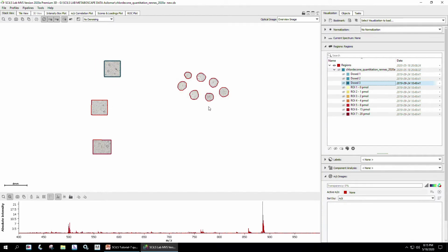On the right, these are individual standard spots with different concentrations, spotted counterclockwise to create a standard curve. The concentration varies from 0 here to 20 picomole per spot. Each spot is 0.2 microliter of the standard. So how to perform a standard curve?